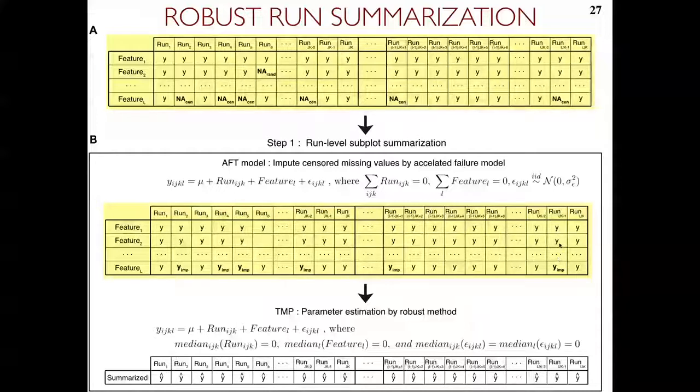Yes, so there may be some parameters that I may not be aware of at this point. So maybe there are some limits where you would not impute in certain cases, but at least conceptually, as long as you have at least one feature in a run and at least one number for this feature somewhere, technically you can do that. I think at the level of converters, you can implement your own filters, and we will see an example. I hope it will help you see.